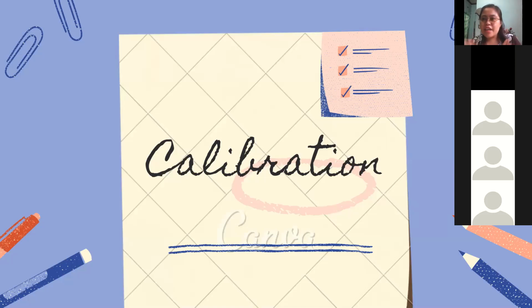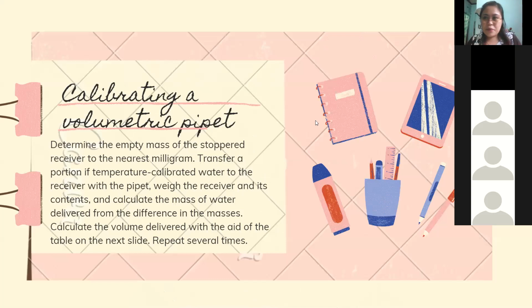Paano nato siya i-calibrate? Actually, ang inyuhang report is also another way of calibrating the equipment. However, I will be teaching you another way here. Almost the same, but we have computations here. And then we have table. Pero wala na ko ginaingon nga memorize ninyo ang table. Kay medyo daghan-daghan siya no. Buang tag-memorize ani. Sa quiz or sa exam, I will let you look at the table for your reference.